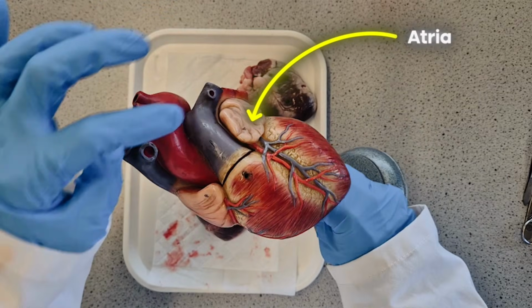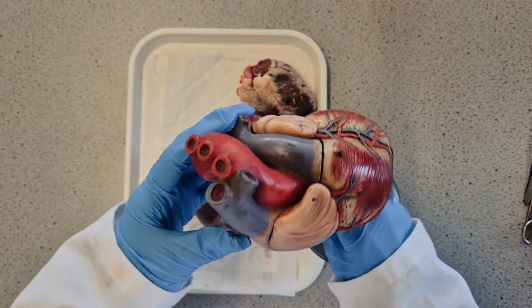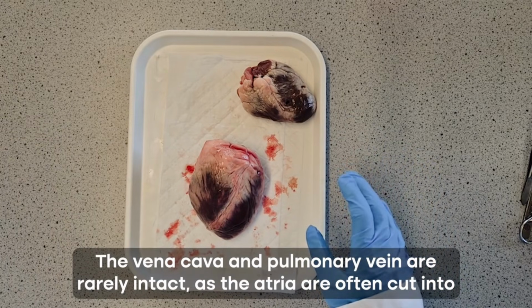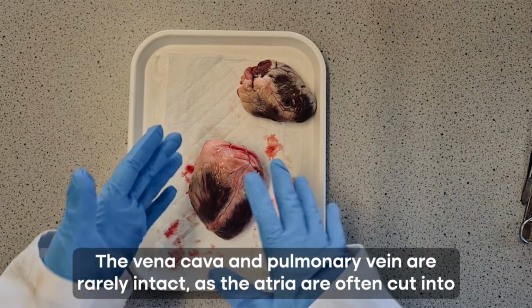Also, the atria are usually quite obvious. Sometimes they get cut off though, so you can't always see them. And then we're going to look out for as well the aorta and the pulmonary artery. It's unlikely that we'll have the vena cava and the pulmonary vein in shot because they often get cut off when we get our hearts.